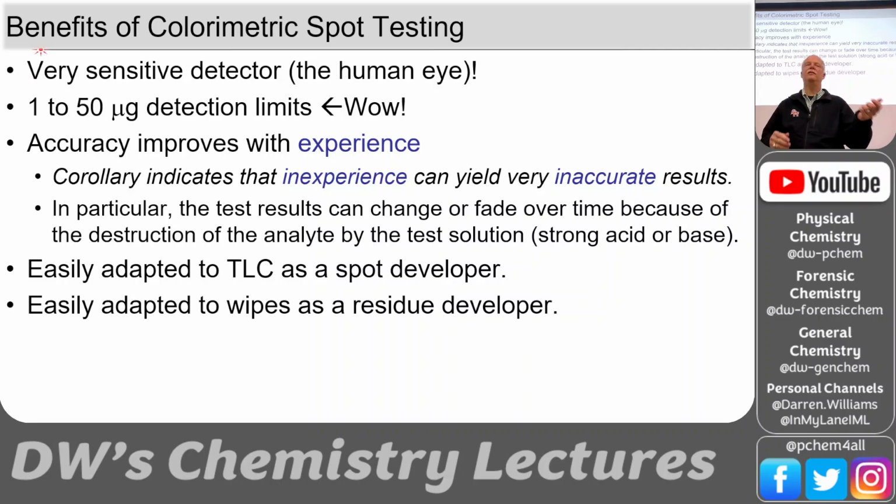And if you're testing for explosives, you're probably not testing for chlorate. You're testing for other explosives. But if the wipe is wiping down someone's luggage and there is a color change, then, hey, we need to look inside this bag. They try to keep the inspection of your luggage going through the airport. This was a few years ago. At that time, it was 6 seconds. So they want 6 seconds to inspect each bag, and it's got to move pretty quickly. So a lot of bags take 2 seconds so that you can spend 10 seconds on something that looks a little fishy. Well, we had the color change agent.